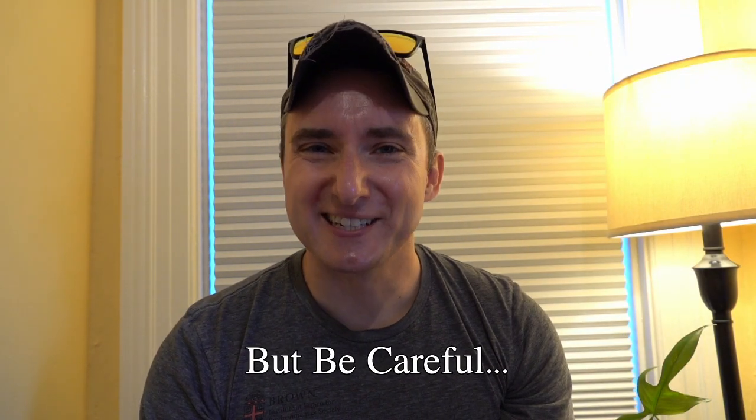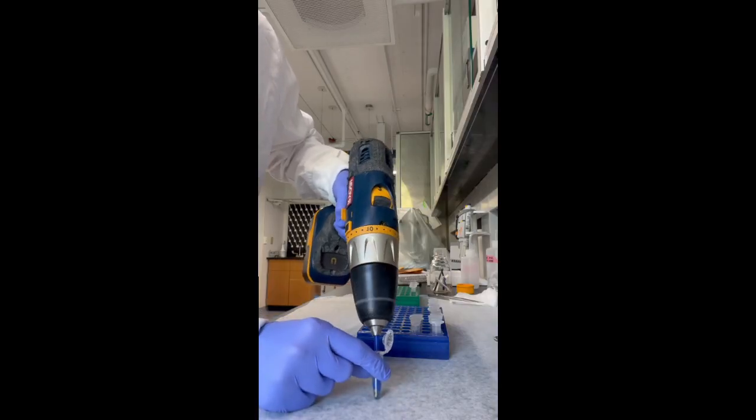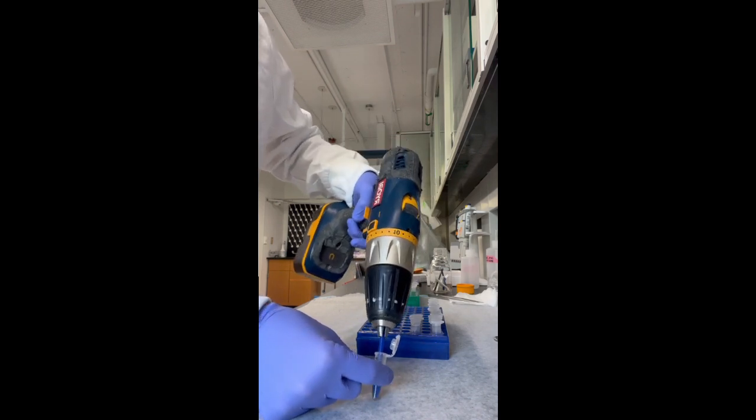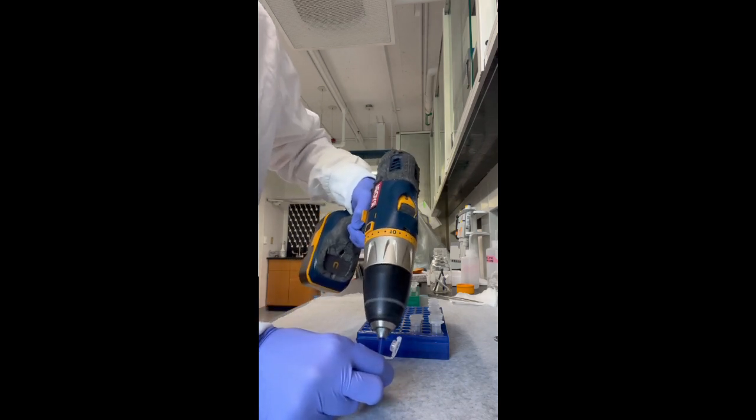When you're using the drill, you just want to take care to avoid a couple of mishaps. If you watch the video again, what you'll notice is that we're drilling in spurts. We don't just stick it in there and drill for a very long period of time. The drill is creating friction in the tube, and that's creating heat. If you create too much heat, you could boil your sample, literally, and that's no good for the DNA. And the other thing that you can do is you can actually melt the plastic in the tube, drill straight through the centrifuge tube and lose a sample. So you just want to be careful about that.